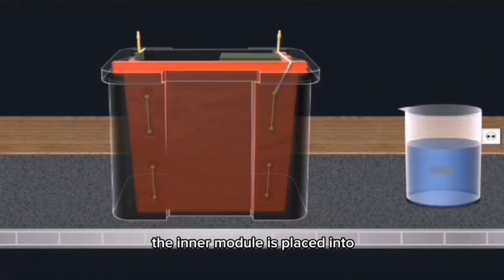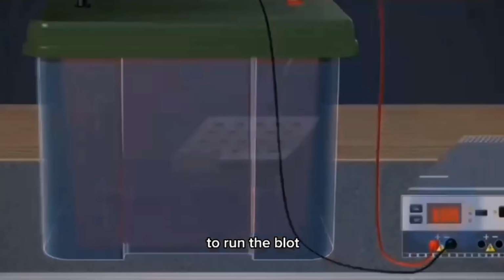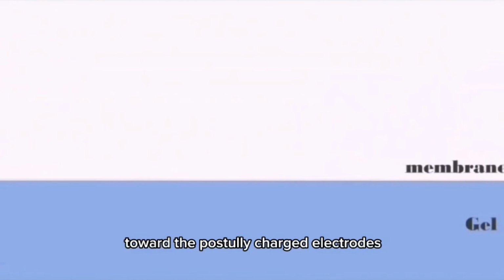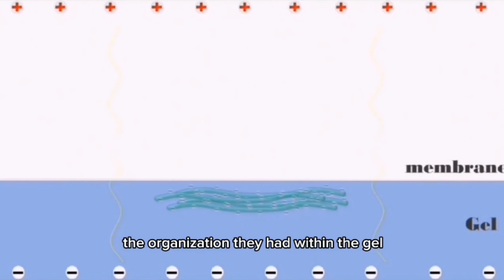The inner module is placed into the electrophoresis chamber, then the chamber is filled with the blotting buffer. Next, a lid is placed onto the electrophoresis tank and electrical leads are connected to the power supply to run the blot. Electroblotting uses an electric current to pull the negatively charged proteins from the gel toward the positively charged electrodes and into the membrane. The proteins move from within the gel onto the membrane while maintaining the organization they had within the gel.